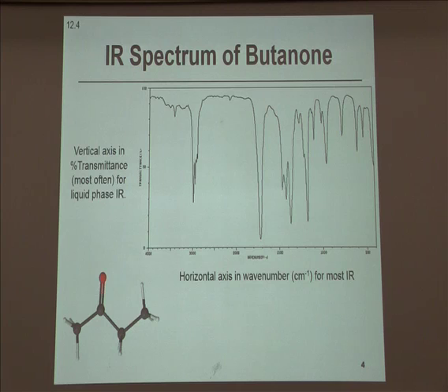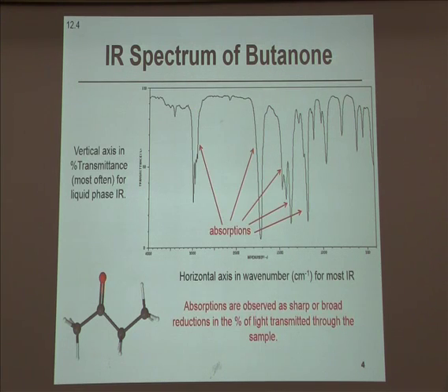In NMR, carbon and proton, all of the peaks are going up from a baseline at the bottom. In the case of percent transmittance IR, all of the peaks are features that are coming downward from a baseline across the top of the spectrum. And so it's important to notice that these downward aimed peaks are the absorption features. And we're also going to care, as we look at these spectra, that there are regions where there's no significant absorption. So the presence of these downward aimed peaks gives us some information in those regions. The lack of any peaks in that region also gives us some good information.